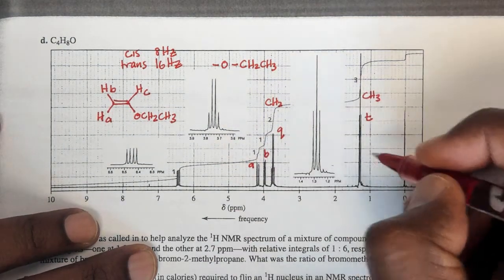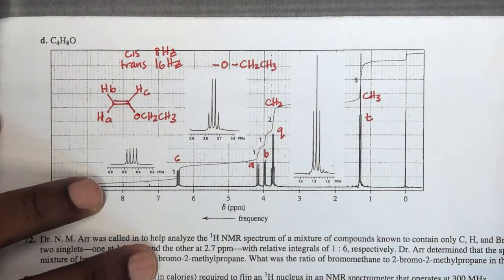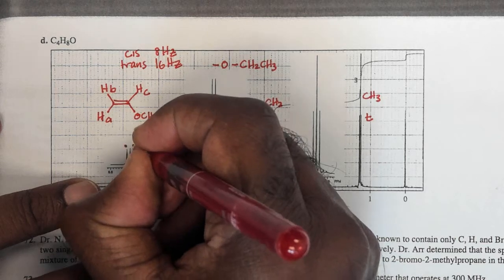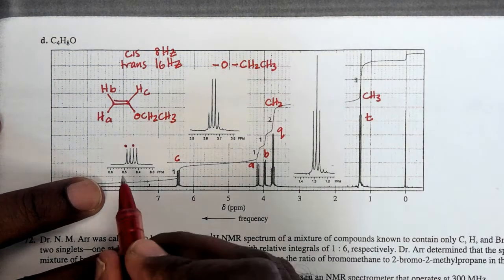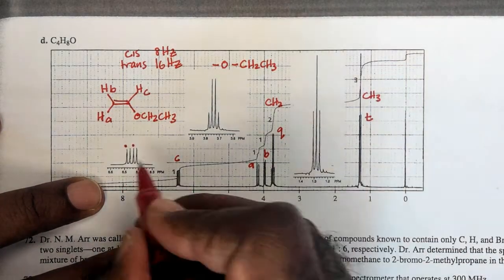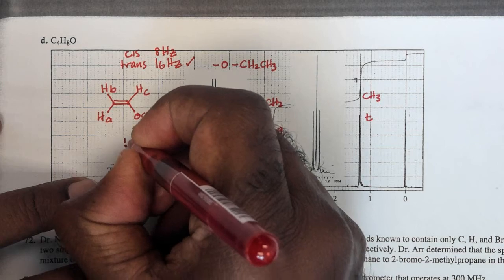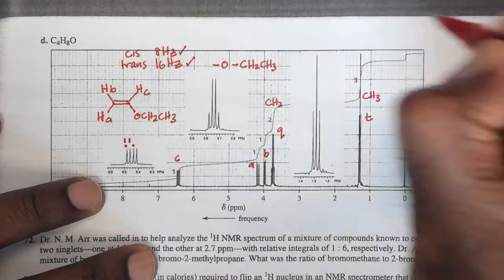There's your CH2, there's your CH3, and the C here with the double doublet would have a coupling of both. If I look at this particular peak, I'm showing a big expansion here, so the first line and the third line is your 16 Hertz, and the other two, the first line and the second line, is the 8 Hertz.